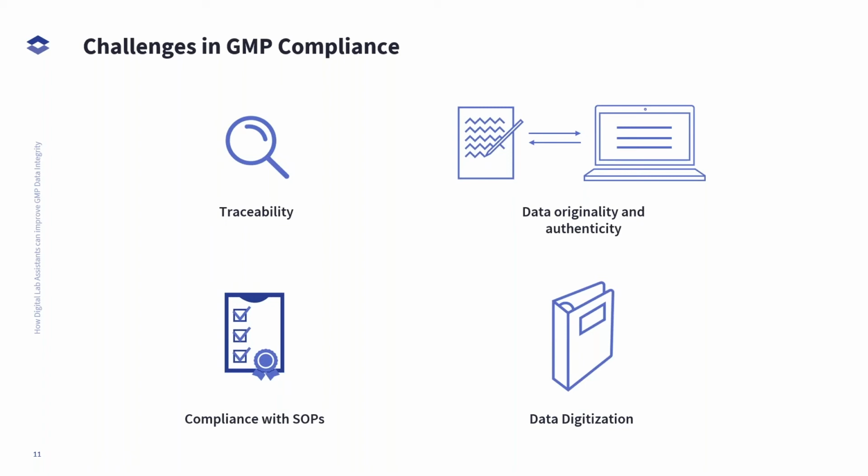It's difficult to start finding all these batch records from years before. If you have a digital system that supports all the data, including laboratory, it makes a completely different streamlining of audits and also builds the trust of the inspectors in the originality of your data that you're recording in your laboratory.